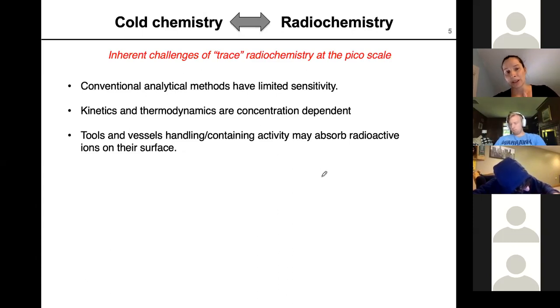So one way of actually avoiding this is to work with very acidic samples to sort of load up the proton concentration in the sample and essentially coat out these cation binding pockets that the glass has so that we can diminish binding of the radioactive cations.